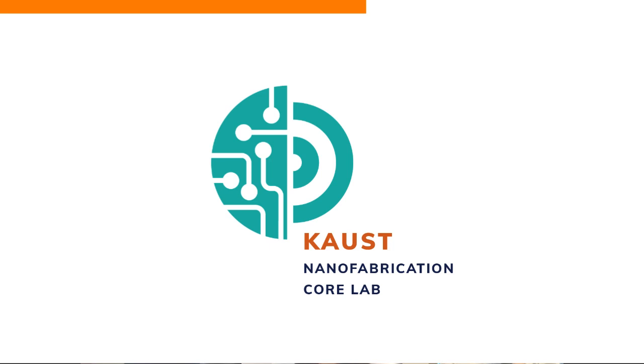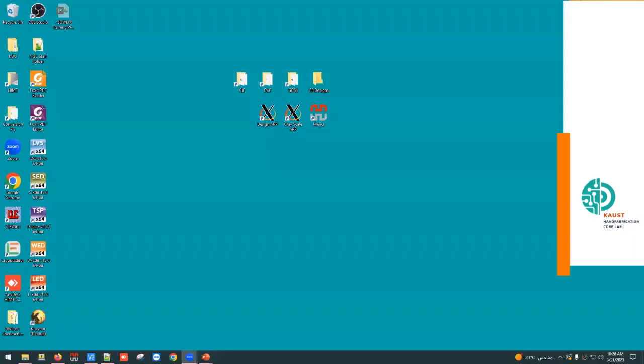Now I will show you how to do this translation. I will follow all the procedure that I shared with you, like the workflow to expose, and I will show you how to use both softwares. So now let's see if I do it correctly this time. I will share this screen here.